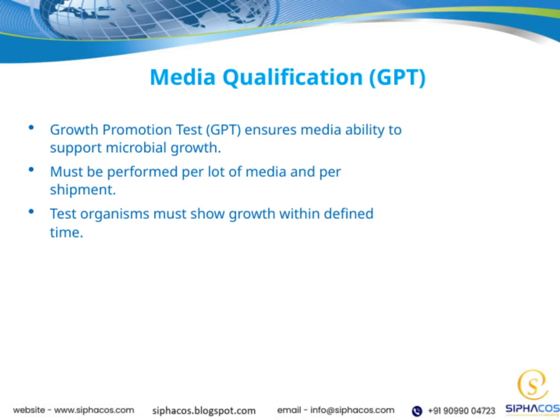Now, let's talk about the growth promotion test, or GPT, which is essential to verifying that our media can support microbial growth effectively. It's important to remember that this test must be performed for each lot of media and for every shipment we receive. This ensures consistency and reliability across all batches. During the test, we inoculate the media with specific organisms and observe whether they demonstrate growth within a defined time frame.